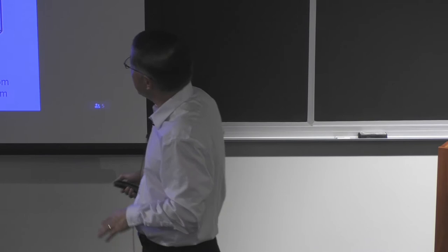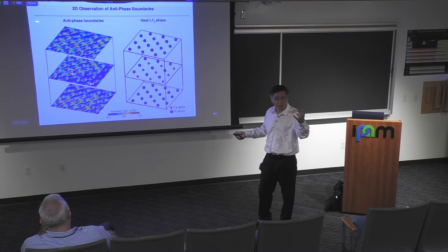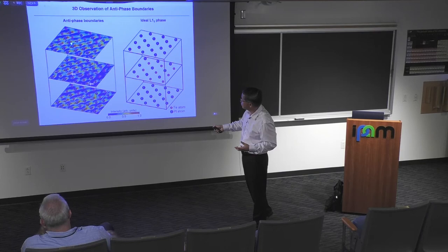And we also look at the individual atomic level. This is the density, the bottom color corresponds to our reconstructed density, and from the density we identify atoms. Our technique is proportional to Z to the power of around 1.5, some groups said 1.8. So the higher the Z atomic number, the larger the blob. You can see this platinum, the blue, and the iron is red, a small blob.